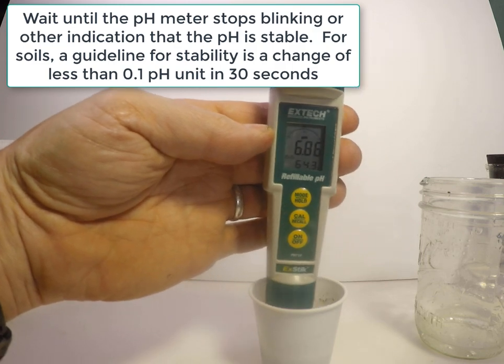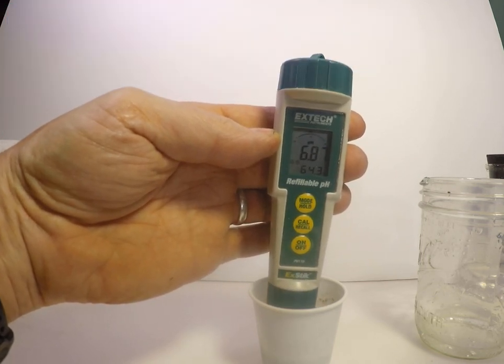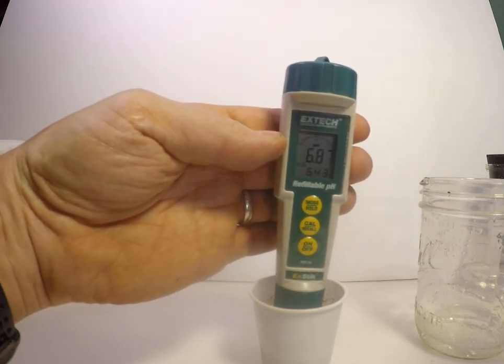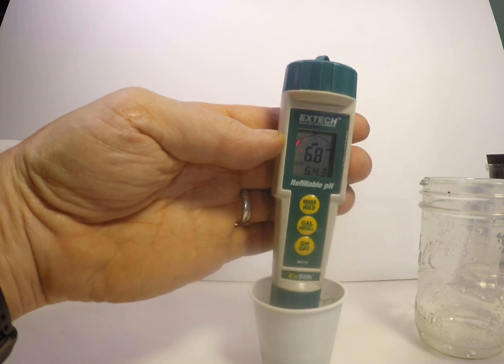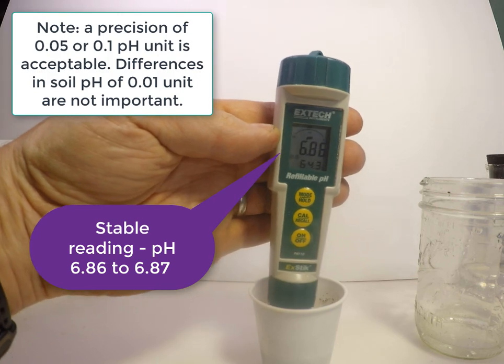Once you are satisfied that you have a stable reading, you can note the reading to the nearest 0.05 or 0.1 pH unit. In this case, we might read the pH as 6.86 or just 6.9.